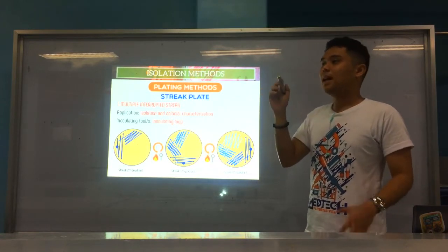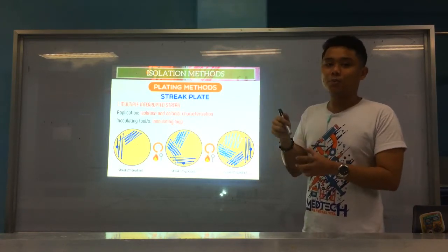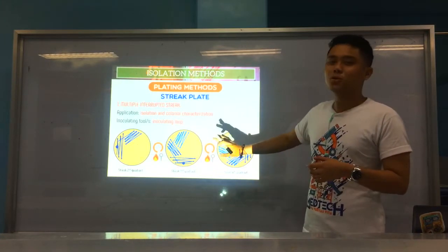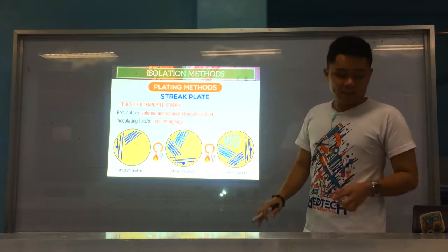So that's your multiple interrupted streak. When you say multiple interrupted, for every quadrant, you flame the loop. So the streaking is interrupted, not continuous. Okay? Alright, that's for multiple interrupted. It's the most common isolation method that I use on plates.